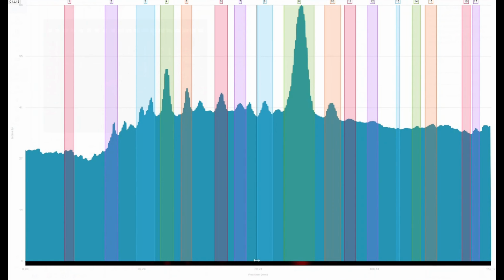And you do also get the slice of the image as you do within the main view, blown up to match the entire size of your screen within focus mode as well. So you can line up what you'd be seeing on the image with the data that you're extracting from that image in terms of the lane profile.